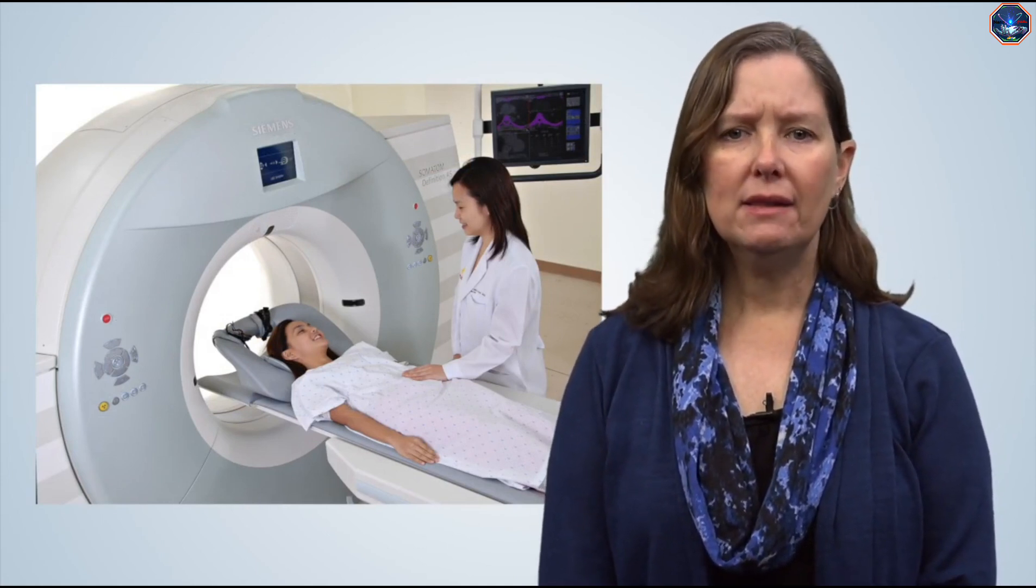The x-rays do not damage or alter the sample. The MicroCT is the same as a hospital CT or CAT scanner, but this technique can achieve much higher resolution on small samples.